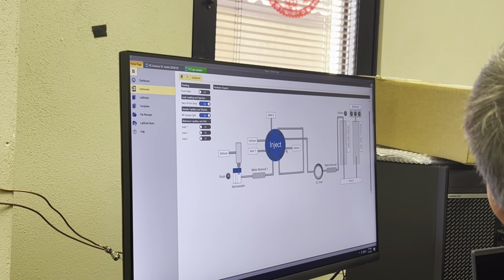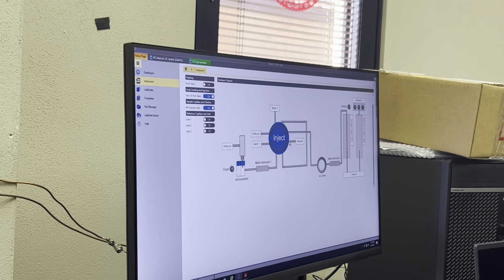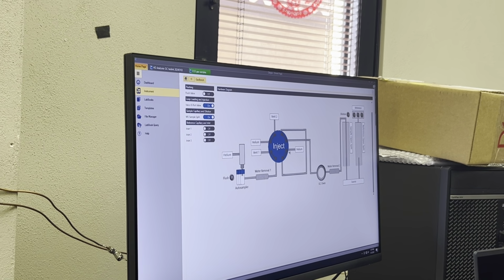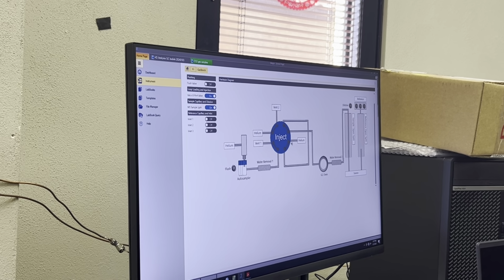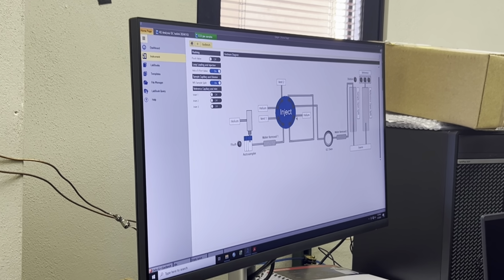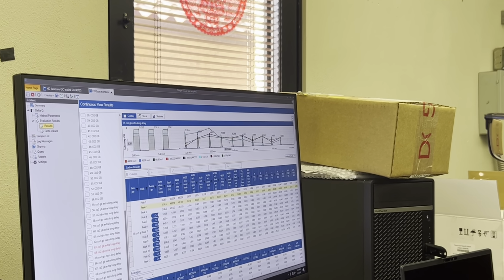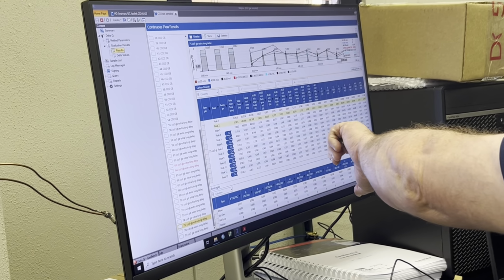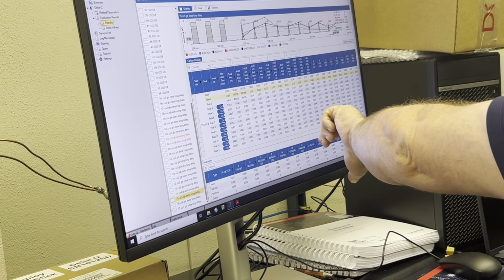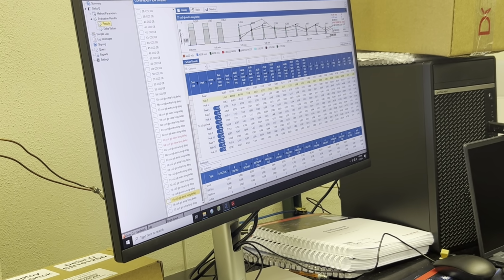I understand now. So both the load and inject mode are for sample, not for flush. Purely for samples. So you load it, then you inject it, then you load it, then you inject it, and you repeat 10 times. But as I showed you, it gets smaller and smaller because it's becoming more and more dilute. There is a difference, but it's not a huge difference.